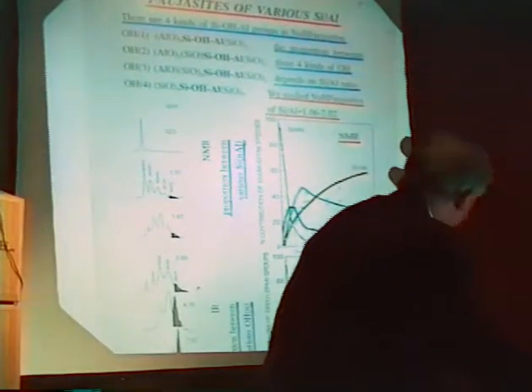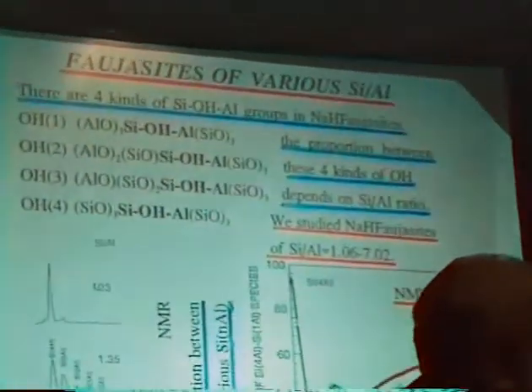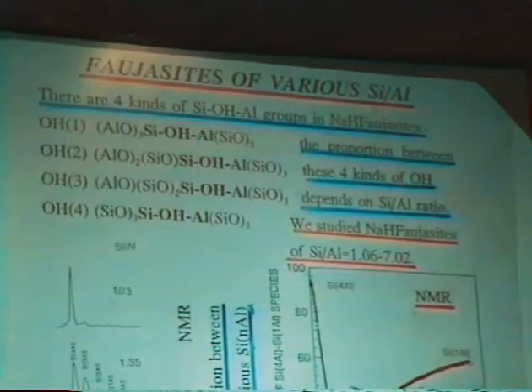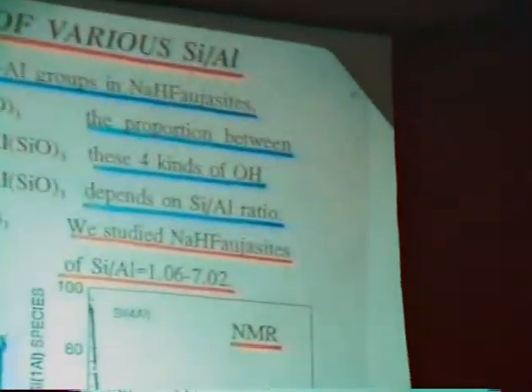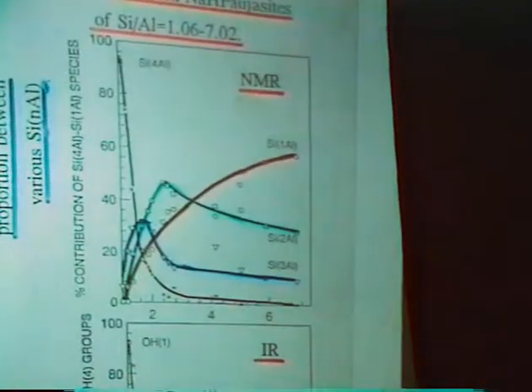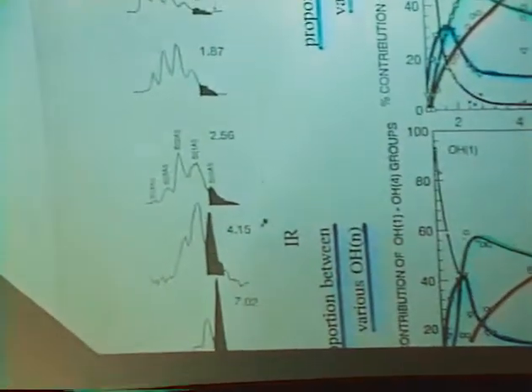The results I just presented indicate that the results of NMR concerning skeleton Si atoms may be well compared with the results of IR concerning bridging hydroxyls.